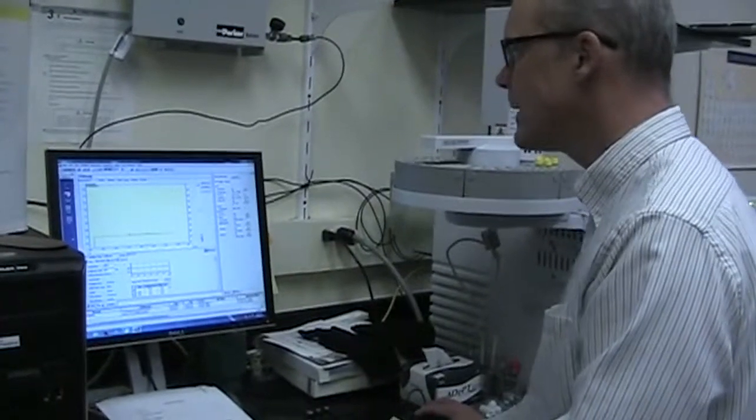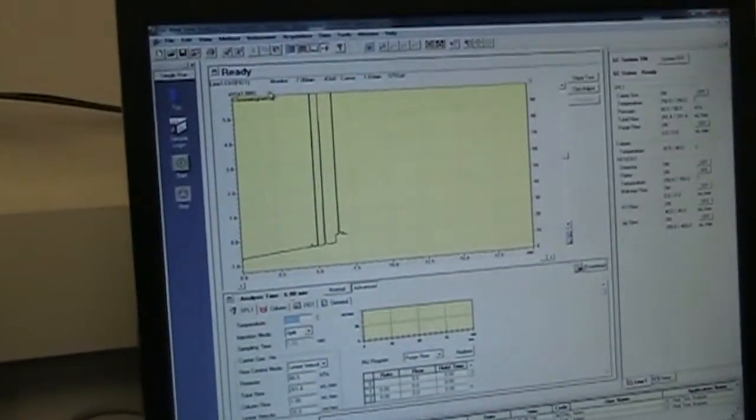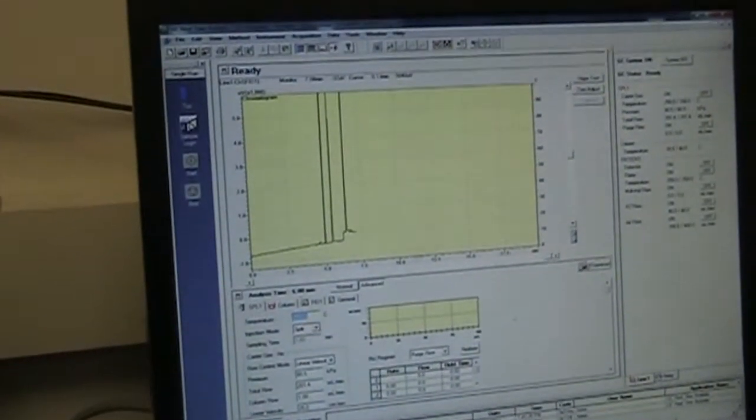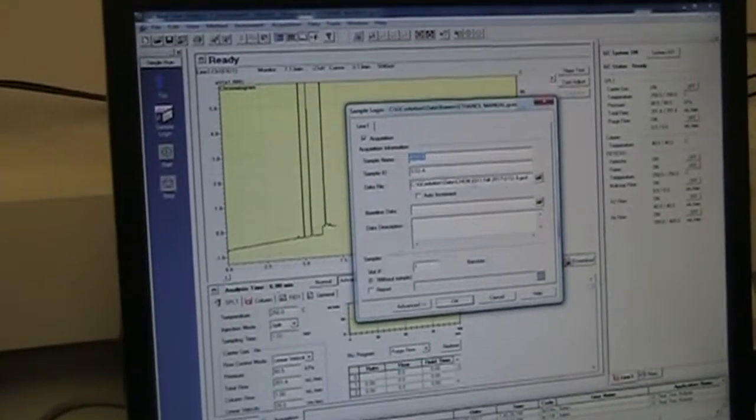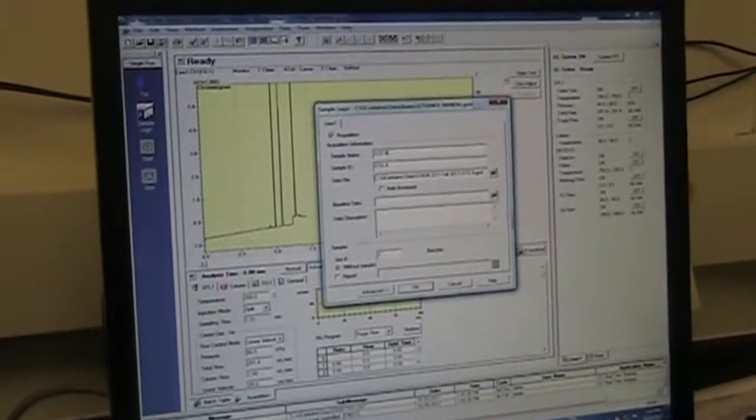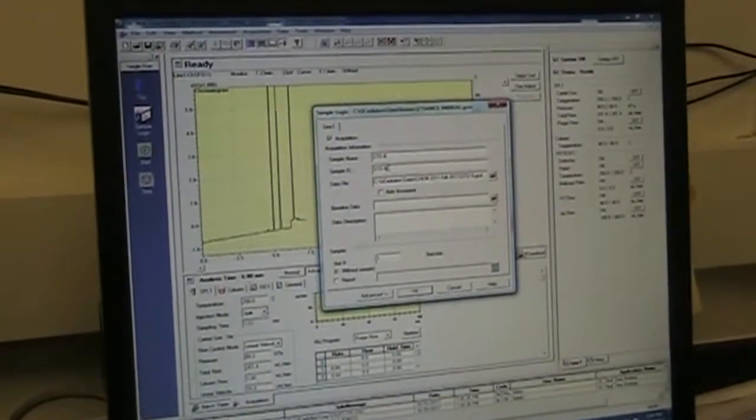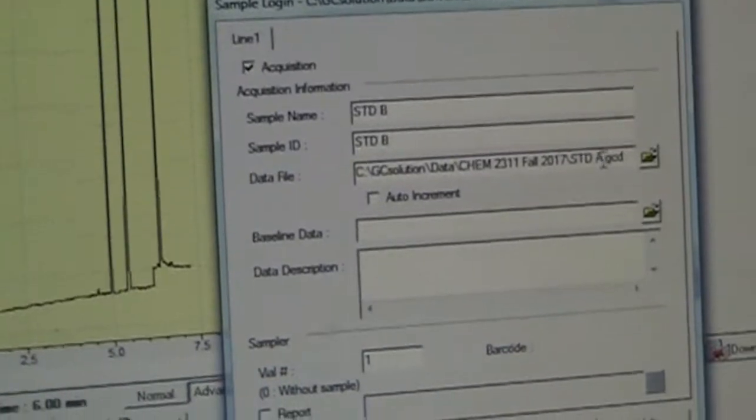So single run and then sample login opens up this screen, and this is where you provide things like the sample name. I'm going to just call this Standard A. Sample ID, I'm going to say the same thing, Standard A, and then the data file, which is really the folder you want the data file in and the data file name.